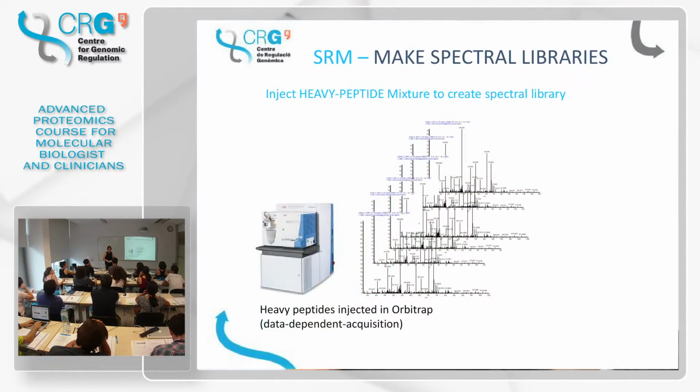Okay. You also need to test the peptides for a very practical reason. That depends on the quality of the peptide that you buy. If you don't want to perform one of those super accurate quantitative assays, but you just want to do some relative quantitation, sometimes you can buy these heavy peptides much cheaper in a lower quality. And you need to check that the peptide is correct and that it gives you a good signal. Sometimes, maybe the synthesis didn't quite work well, or it has a lot of impurities, or whatever.